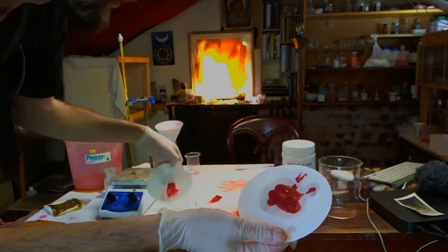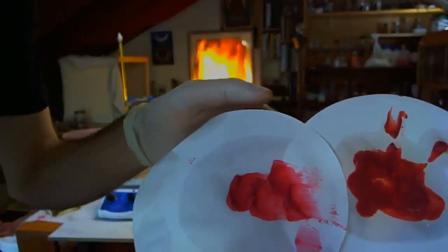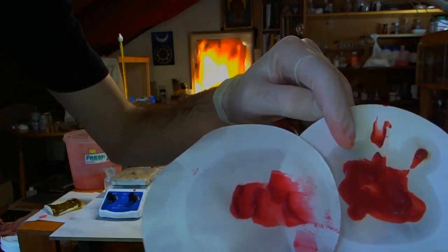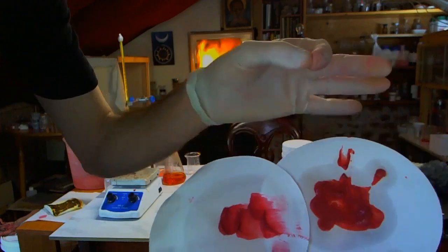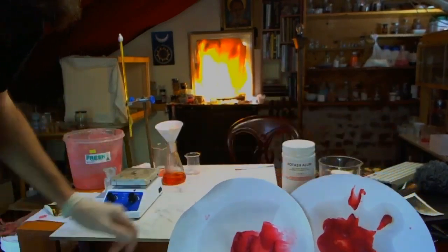And this is what we just did with the lead. Let's compare these two. So again, you can see this is a little bit deeper and a bit more crimson, as opposed to the lead acetate one. It's quite nice. It's very deep. It's kind of what I'm used to as a color.